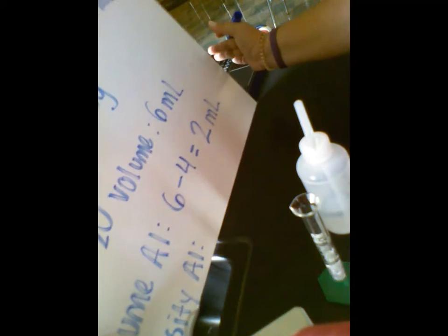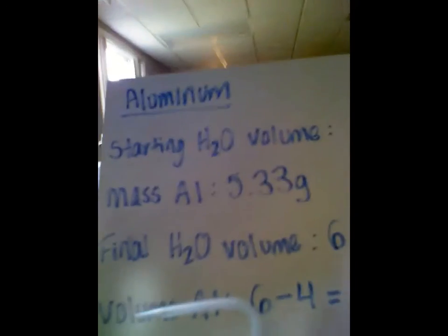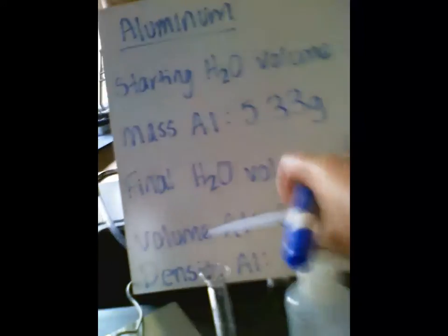Let me see if I can set this up where you can see it. Oh, you're upside down. There we go. Now you're looking at my data table. I promise I'll only do this for a second. I know it's a little shaky.